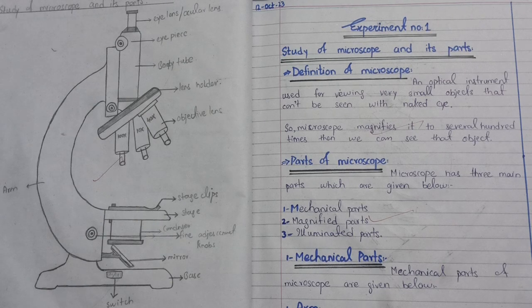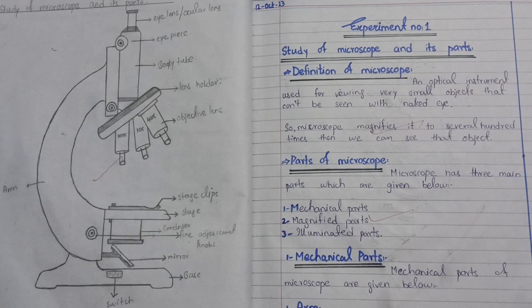The other students belonging to other study fields can also join it, because the material of study is just the same, and they can get the concept of microscope and how to use it. All the things are explained here in a well manner.